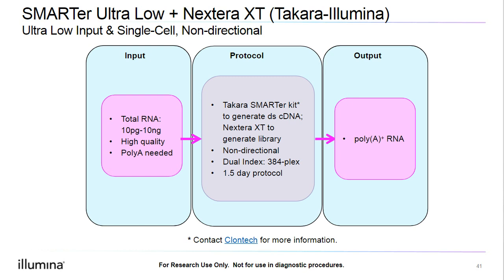Because we're using the Nextera XT workflow for library preparation, we can use the dual indexes from this kit to multiplex up to 384 samples. Keep in mind that this workflow is not stranded.